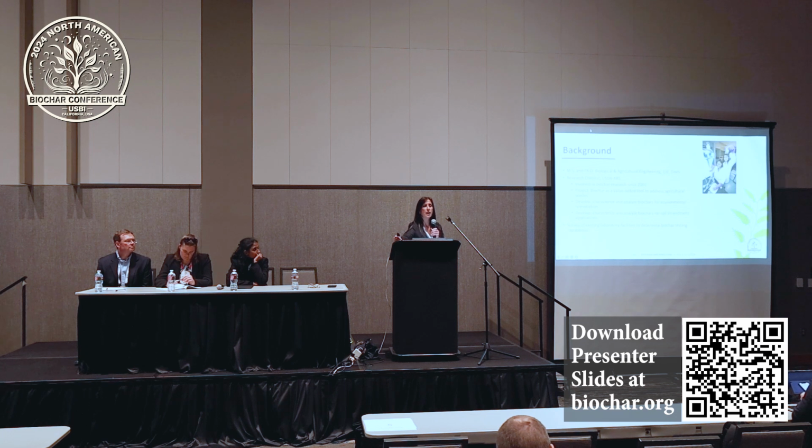As part of the USBI Board of Directors, I was tasked about 4 years ago, right around when the pandemic started, to look into doing a survey of the existing laboratory facilities in the US and abroad that determined the biochar testing capabilities. I gotta say, it was a little bit of a frustrating process because, due to COVID, a lot of the laboratory facilities were doing remote work, and you can't really do remote work when you're analyzing samples. So I had a really hard time identifying laboratories that would even do the bare minimum in terms of what's defined now as an IBI standard.